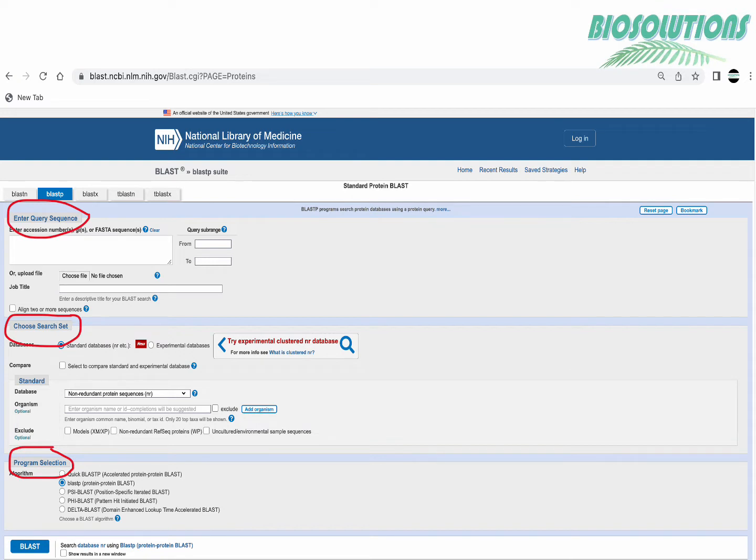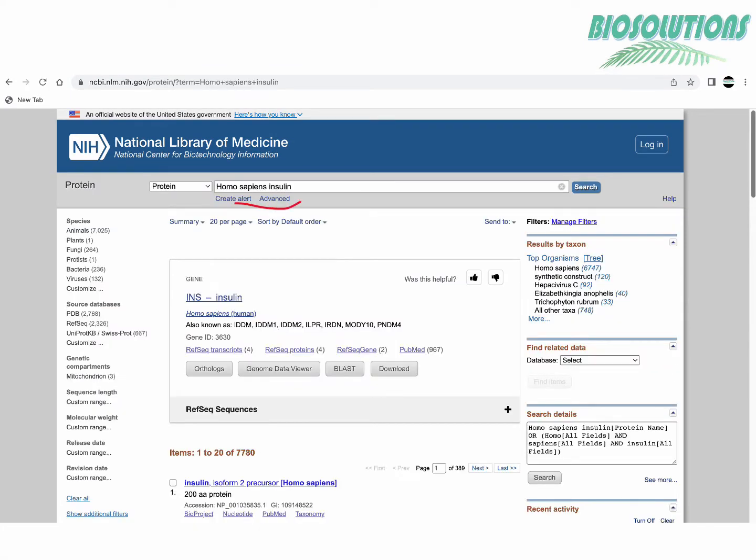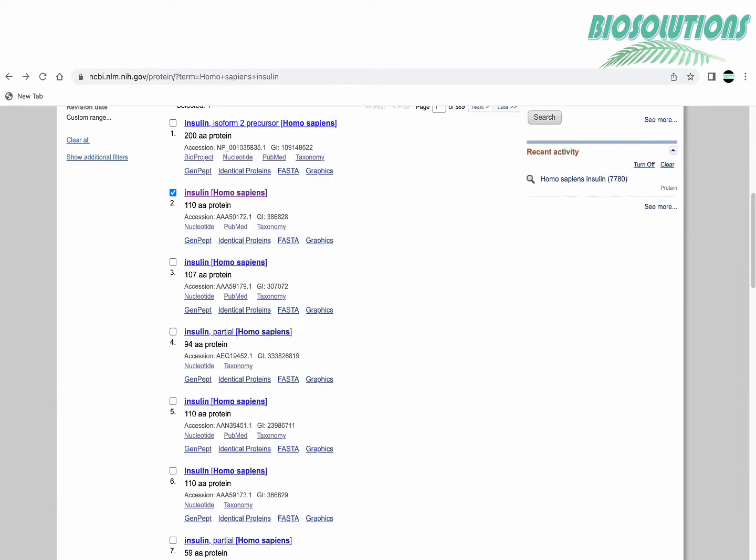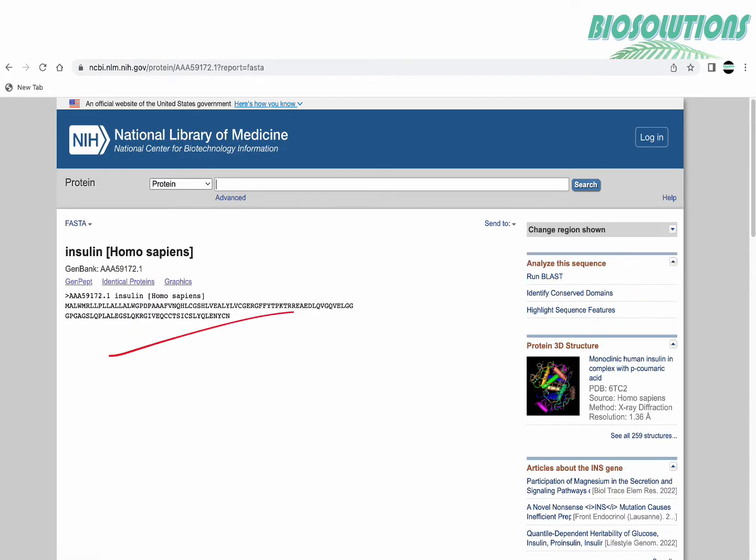Now to get the query sequence which in our example is going to be human insulin protein, we will search separately for a database called protein in NCBI or you may search SwissProt. I have shown here the protein database and we choose an appropriate insulin sequence and get the sequence in FASTA format.